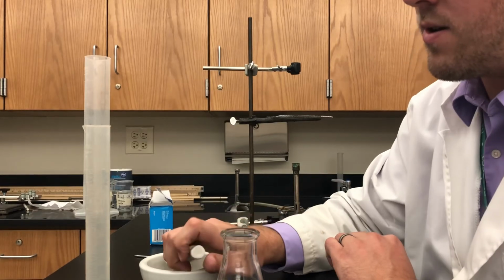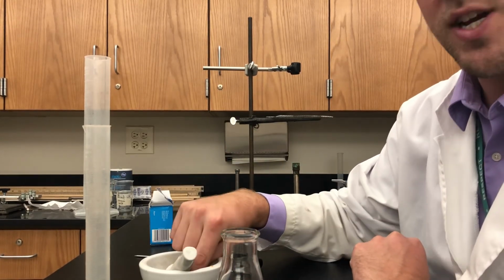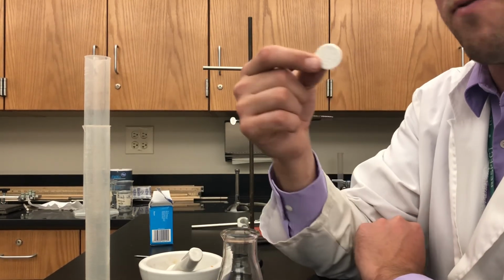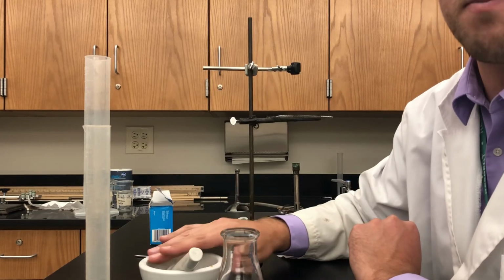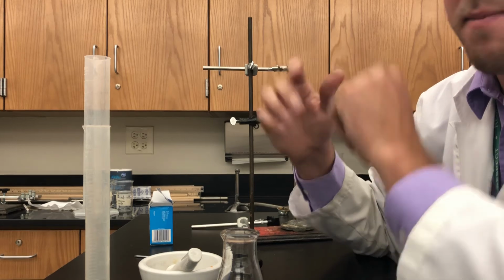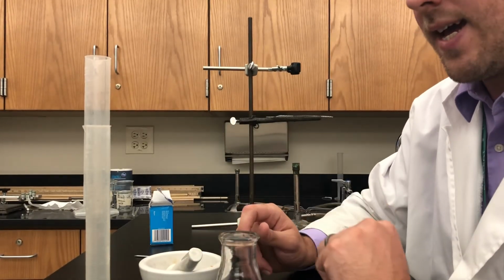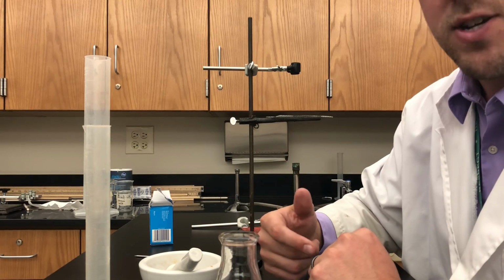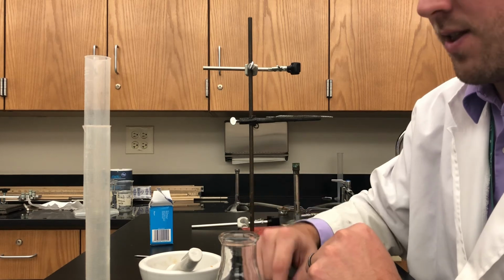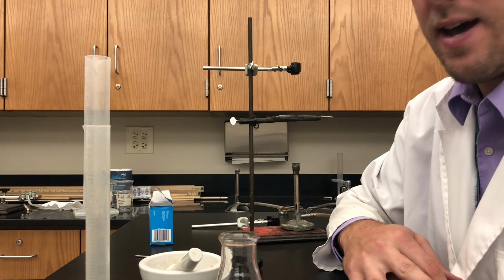What you're doing is you are breaking up the number of particles that make up the tablet. You're not changing the amount of the tablet. If you quarter it, you should still use all 4 quarters, or when you powder it, you should still use all the powder, but you're changing how large the particles are that make up that material. And then you're going to do the same thing where you add it to a certain amount of water and see how fast that reaction occurs, and then you'll do that at those 3 or maybe more different levels of particle size. So that's the procedure.